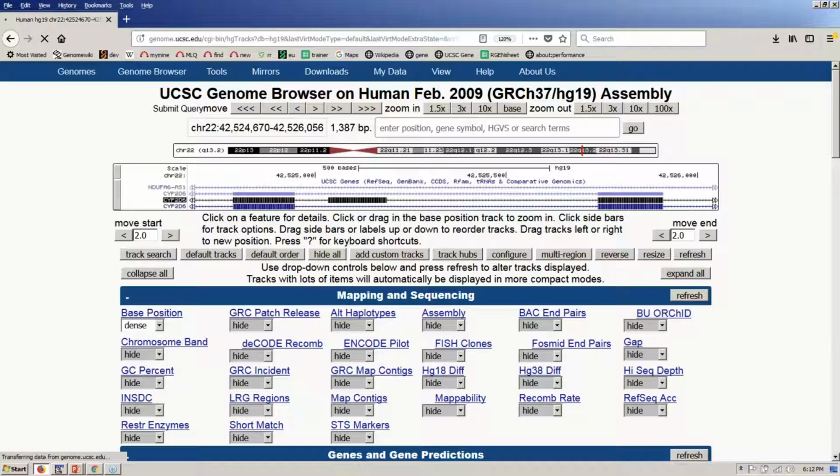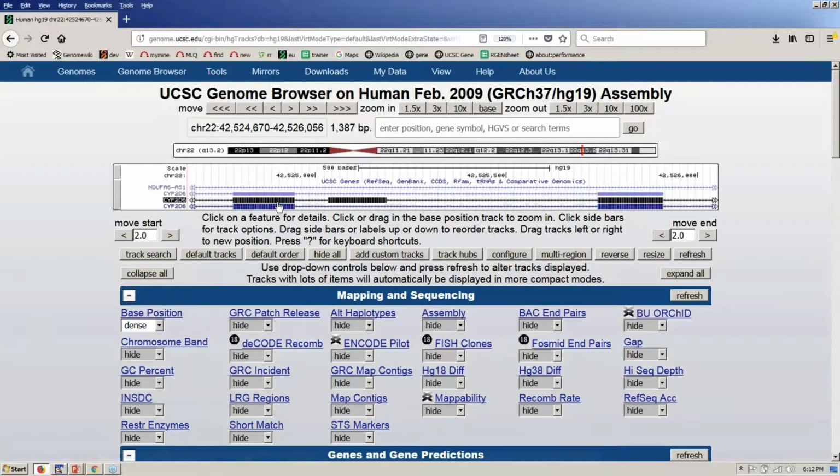And what we have here is a spot where we have isoforms of this gene with some differential splicing in the middle. The one isoform has 3 exons in the screen, and the other one has 2. And then there's one here that's not translated. I didn't mention it earlier, but the untranslated regions on the ends of genes are shown in what we call half-height boxes. They're not as tall as the other boxes that are protein coding. And you can see here that these stripes, the dark and light stripes, don't show up in this one that's not being translated in this region.